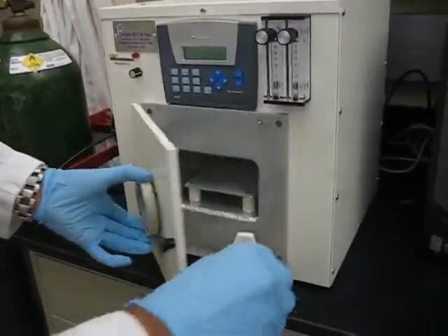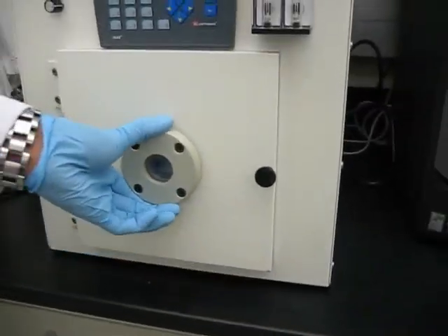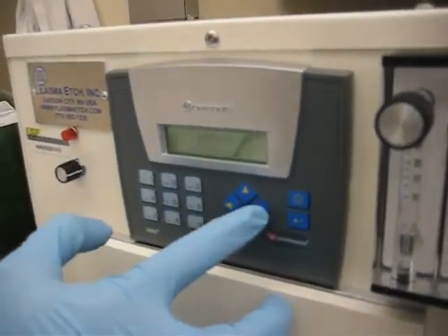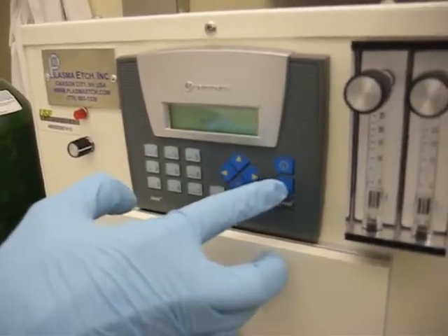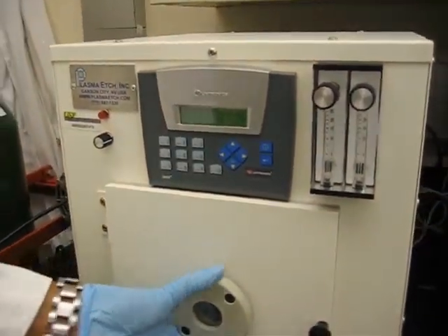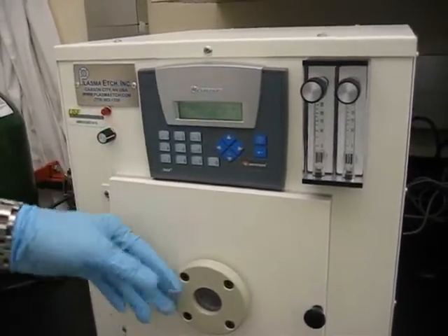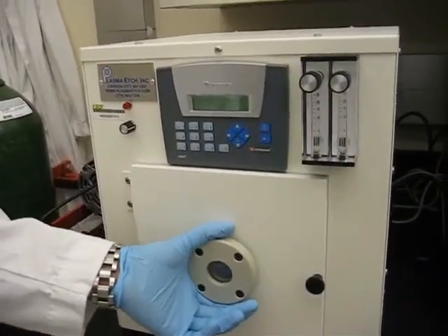We're loading this sample into the chamber and simply close it, and we start. This has a pre-programmed program with a plasma time of five minutes already programmed in. I'm just starting the program here. Initially it pumps down the vacuum to the set point, which takes approximately one to two minutes, and then five minutes for the plasma run.